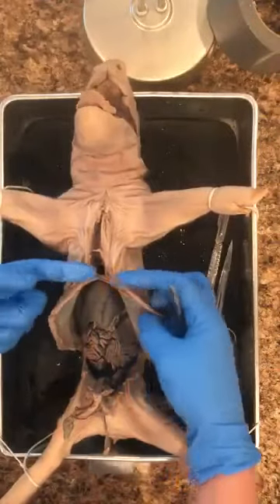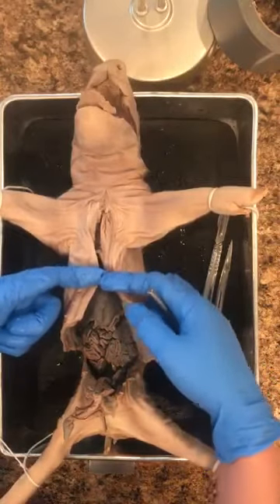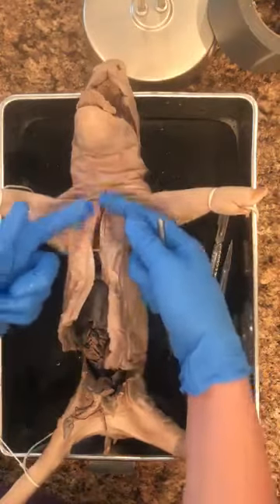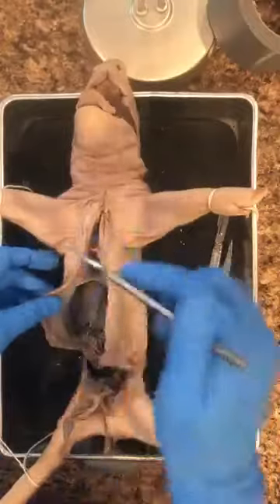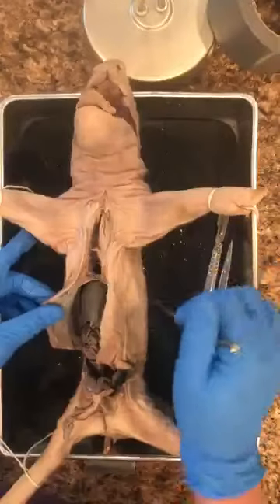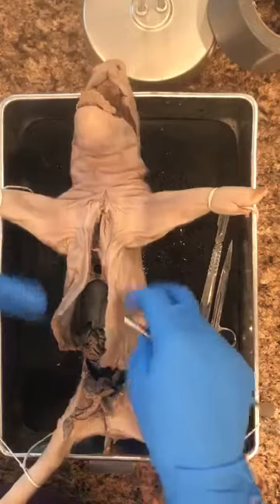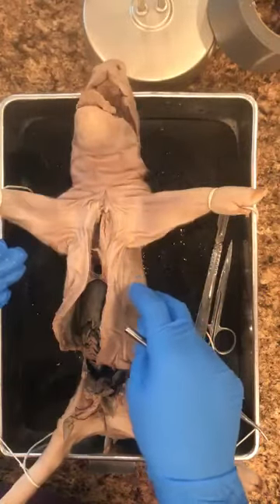And there is this thing right here. It is a muscle, and it's called the diaphragm, and it's going to separate the abdominal cavity from the thoracic cavity. It attaches to the body wall, so it's all along the inside here. It separates the abdominal from the thoracic cavity, but it's really separating it from the lungs and the heart.